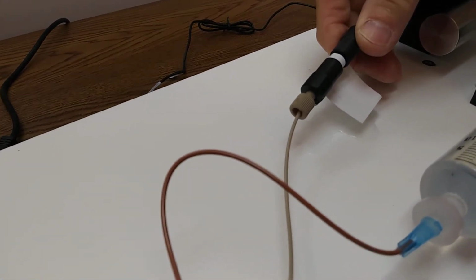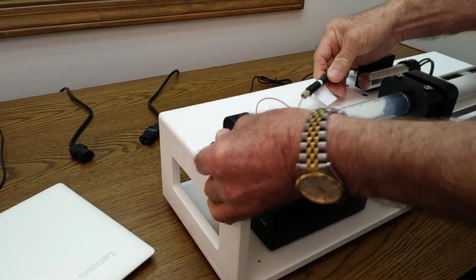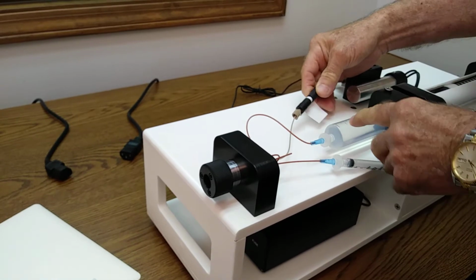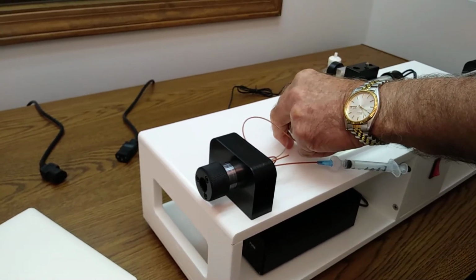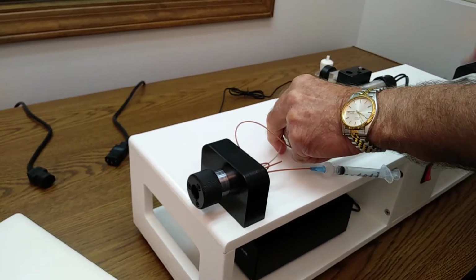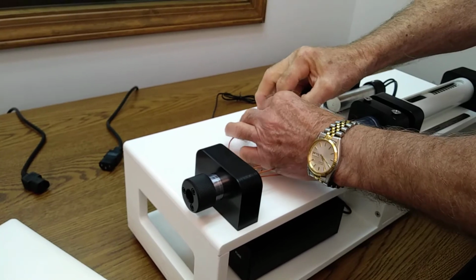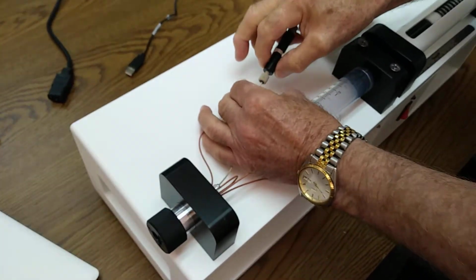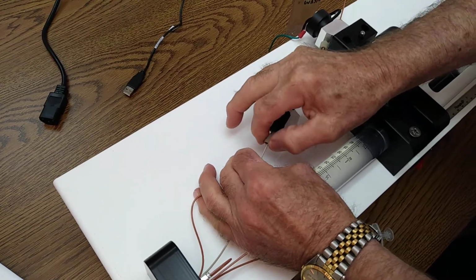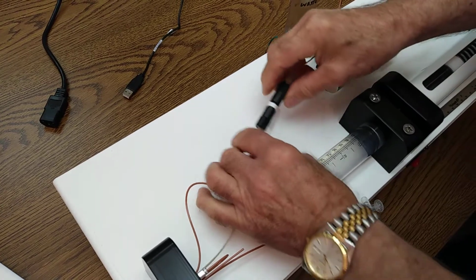So now I'm going to rotate the injector to the other position. Now the flow is going through the sample loop and again out on the tabletop. So with that dripping a little bit, I'm going to put a little bit of pressure on the eluent. It's dripped enough now. I'm holding this firmly in my left hand, pushing the little 16th inch tubing inside the column as far as I can. And while that's in place, I'm going to gently tighten the fitting to finger tight.